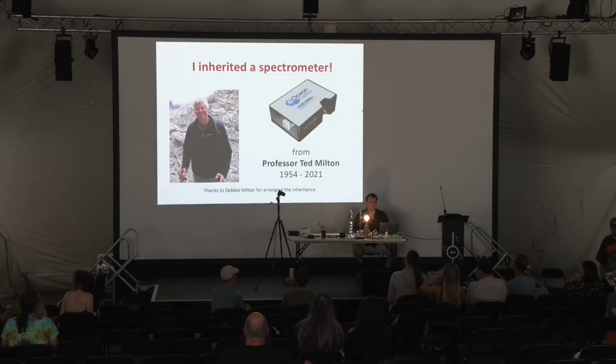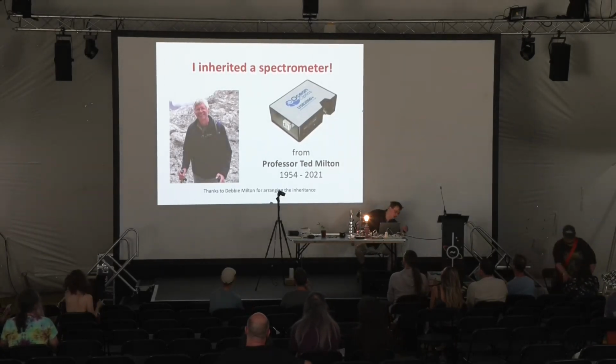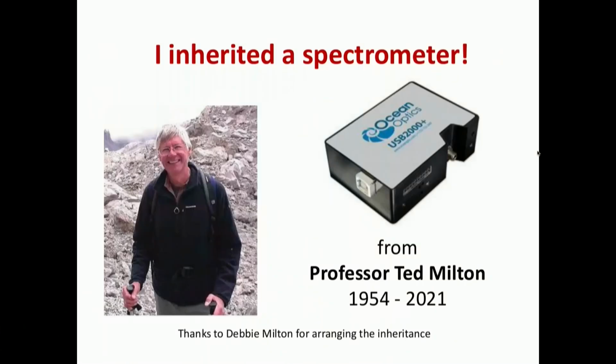Hello everyone. So a couple of years ago I inherited a spectrometer, this thing here. I'll explain what it is in a moment. I inherited it from my PhD supervisor, Professor Ted Milton, who unfortunately died a couple of years ago, and I got a lot of his scientific kit.